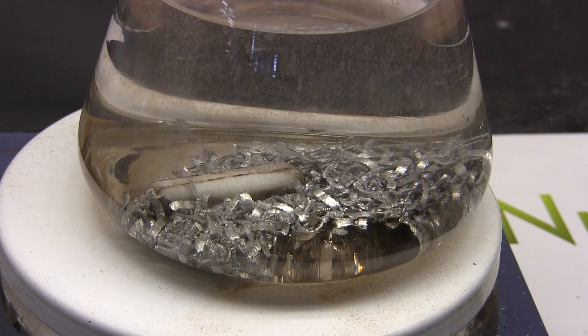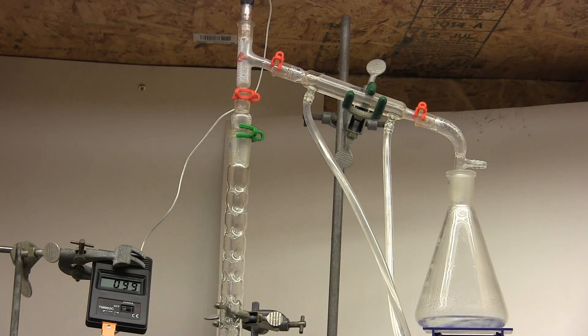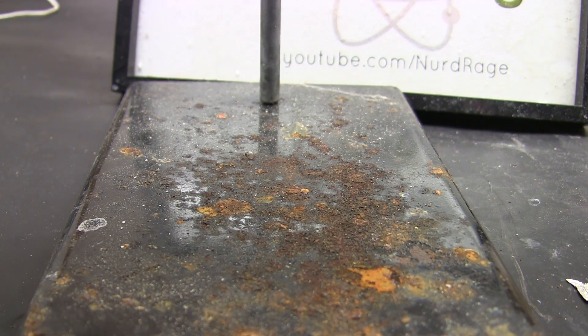There are lots of different techniques to dry different classes of solvents. You've already seen me use fractional distillation to remove water from hydrobromic acid and concentrate it. We'll go over two methods for alcohols in this video and cover other methods for other solvents in later videos as we need them. The first method for alcohols is chemical drying with magnesium.